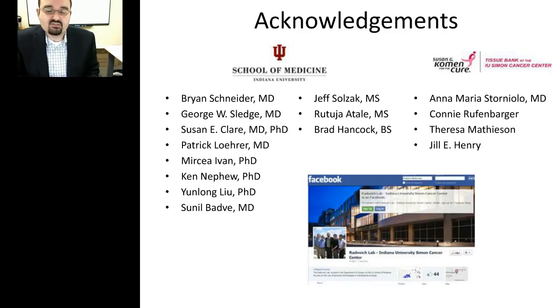This was very exciting from our standpoint, in that it shows that low input FFPE RNA sequencing is feasible from paraffin tissues at very low inputs. And we've actually replicated this with other paraffin tissues and shown that this is doable with samples from a clinical trial. Albeit, sometimes, depending on the age of the study, the age can affect the results of these sorts of sequencing studies. But so far, we've had very good results testing RNA-seq on paraffin tissue from clinical trials.